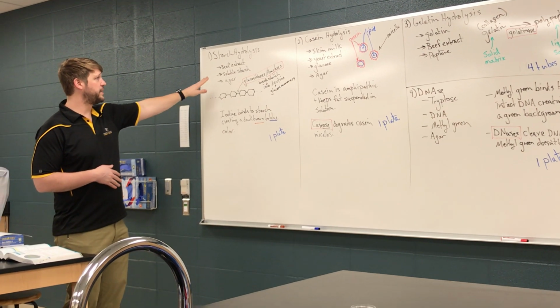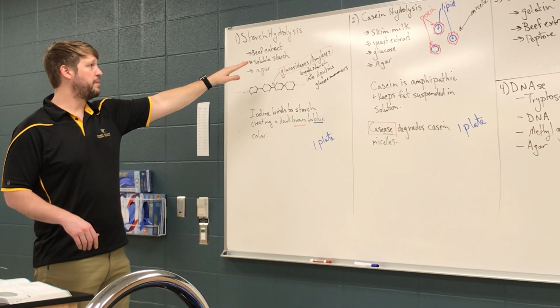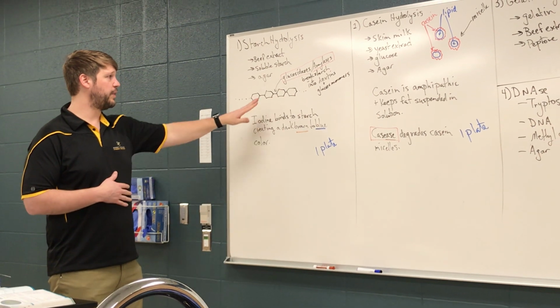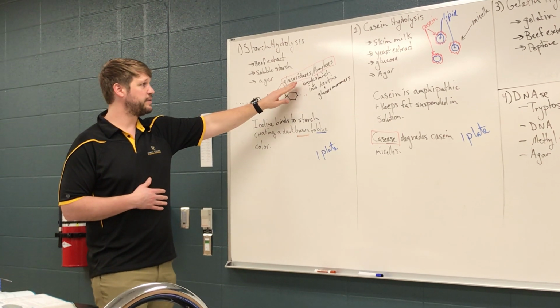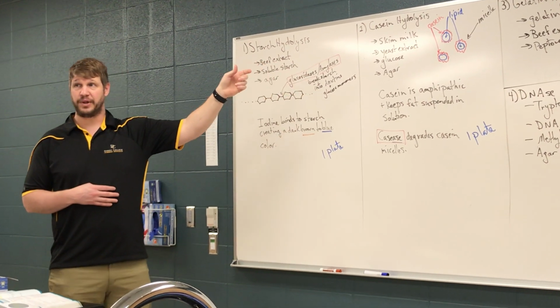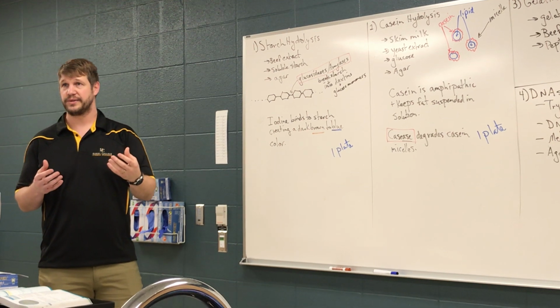Starch hydrolysis. The media basically has some beef extract, which has amino acids and phosphorus and other things. And then the main carbohydrate source, however, is soluble starch. And basically, if organisms are capable of degrading the starch, which would indicate the presence of enzymes for that degradation, which are generally either referred to as glucosidases or amylases. The prefix amylo means starch.